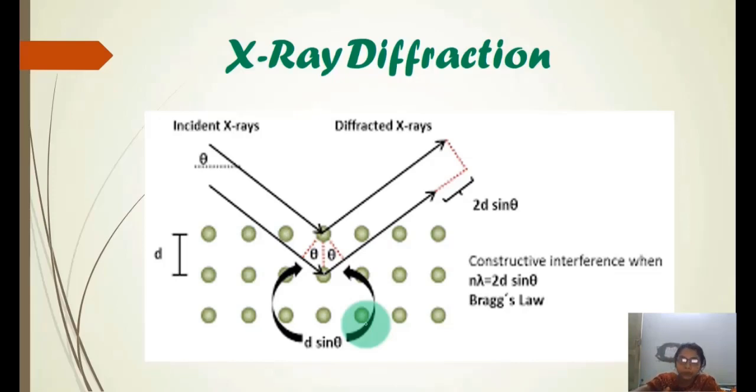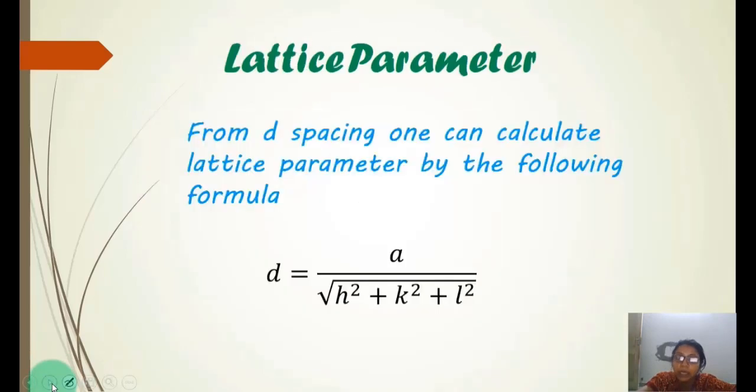If you are using powder diffraction with a monochromatic light, and you know the order of diffraction, and the angle of diffraction is measured from the Debye-Scherrer camera, which is your detector, then you can calculate the interplanar spacing for almost all the crystal planes.